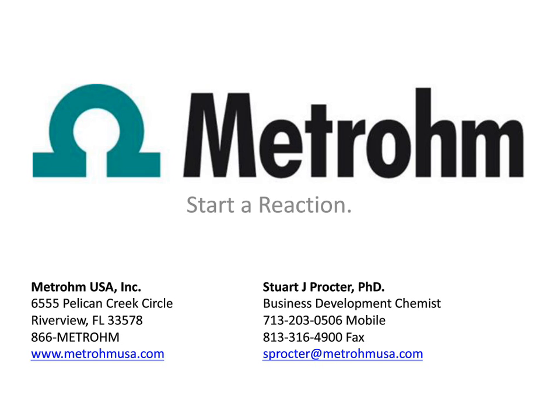Yeah, okay, but if you're looking at ions, that's fine. If you want to look at organics, then again, you could go for the direct matrix elimination approach and try to get it into some solvent and then inject it across a pre-concentrator or an ion trap or a reverse phase trap. So again, it depends exactly on the analyte you want to analyze. The extraction methodology works really well for ions. Obviously, if you're looking at more lipophilic and hydrophobic compounds, then one of the matrix elimination techniques can sometimes be utilized.